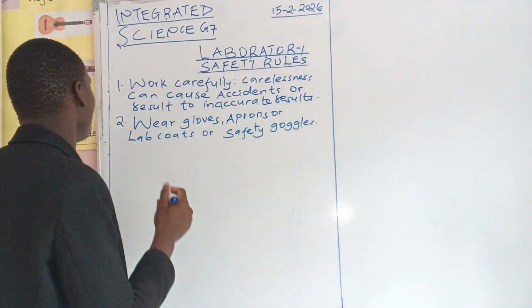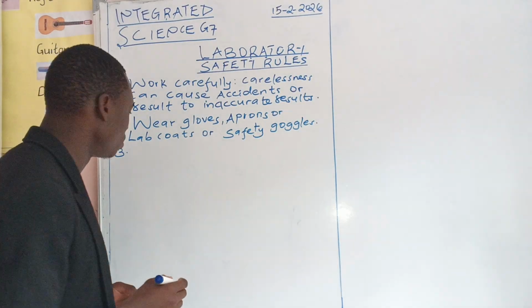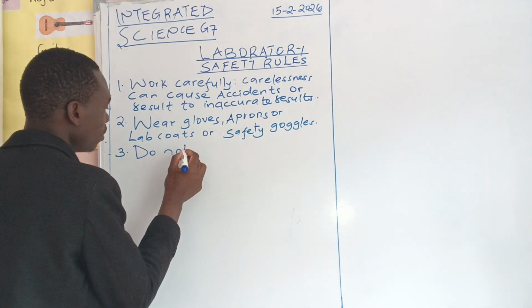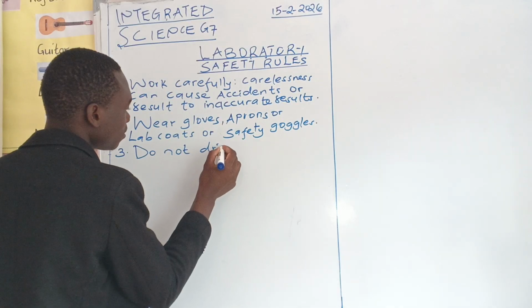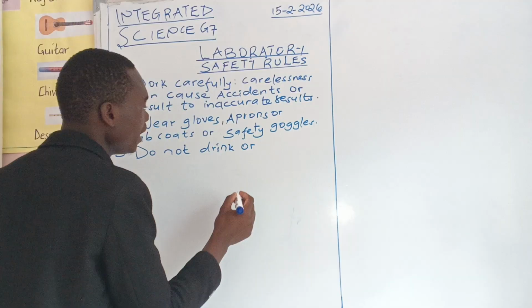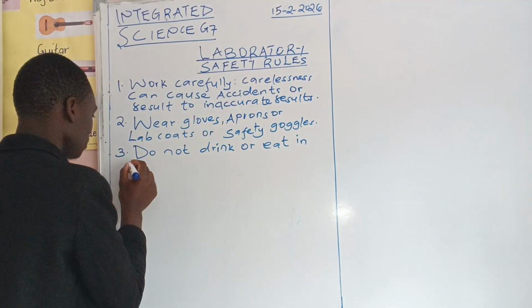Number three, what do we need to do? Do not drink or eat in the laboratory.